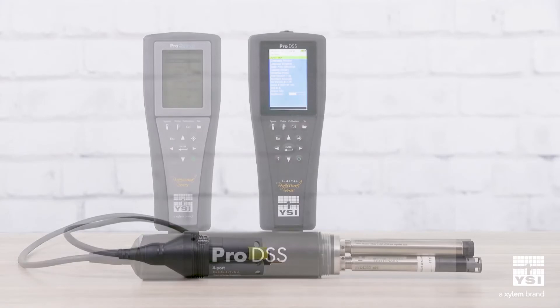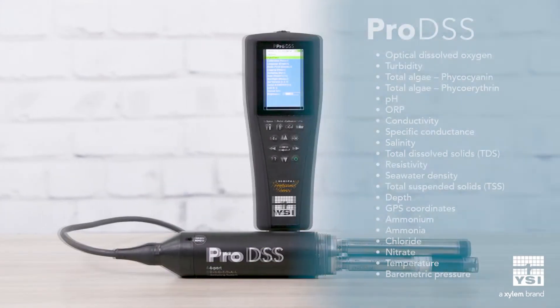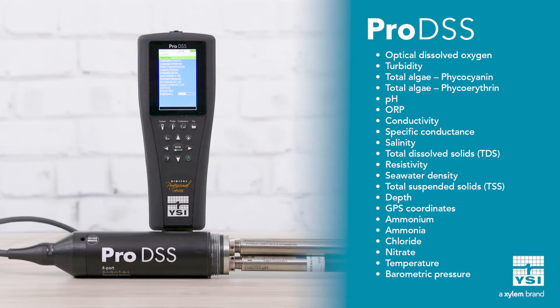The Pro DSS can measure all of these parameters and more, including turbidity, total algae, depth, and GPS. Additional optical sensors provide greater stability and data accuracy in the field. Choose from 21 parameter options to create your perfect system.